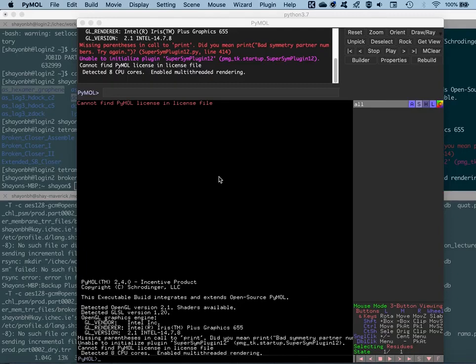Glycine does not have a side chain, which allows it to attain several positions in the plot, mostly the turn or loop regions, whereas proline has a five-member cyclic side chain, which poses steric restrictions in its movement, mostly occupying the phi region. So there are restrictions which allow it to occupy only a certain region, at a phi angle of about negative 60 degrees.